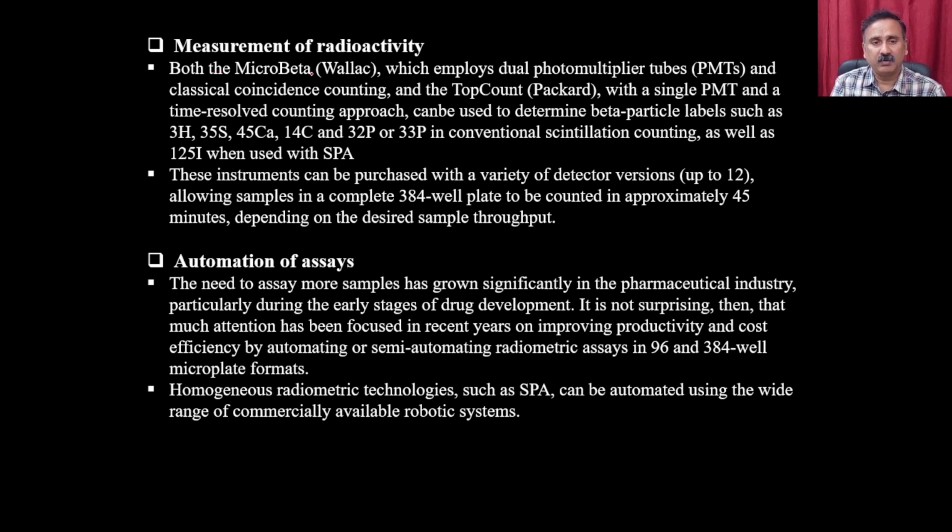So you can use the MicroBeta, which employs dual photomultiplier PMTs and the classical coincidence counter, and the TopCount, with a single PMT and a time-resolved counting approach.